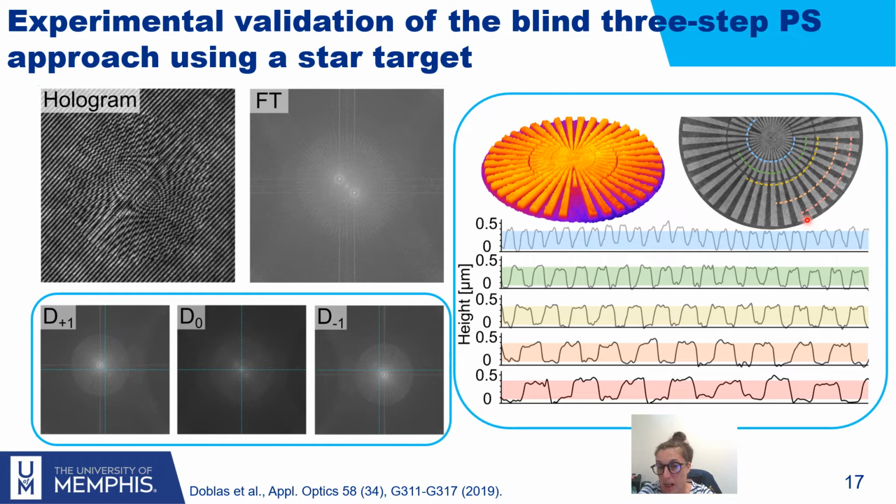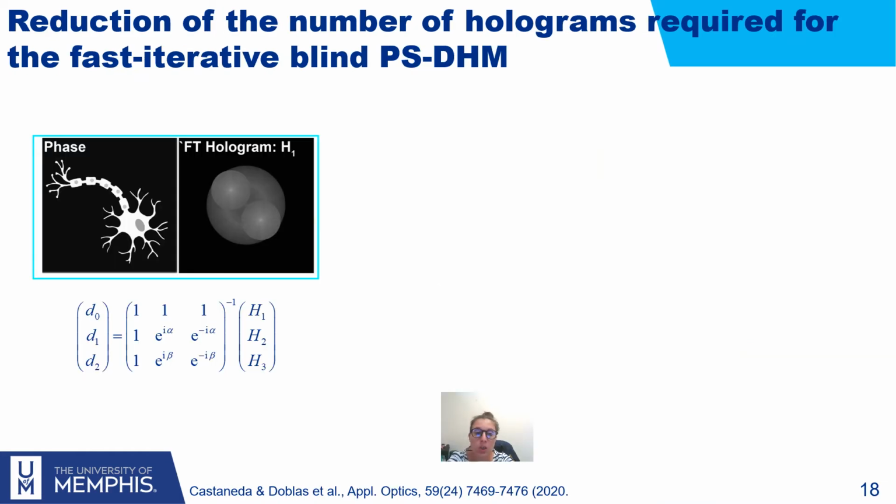radial profiles to quantify the accuracy of the method for the frequency of the pattern, but also for the field of view, to make sure that it agrees with the manufacturer value. So we tested with 3 images and it was working well, but really the object image and the virtual image have exactly the same information, right? So there is only a conjugation between them.